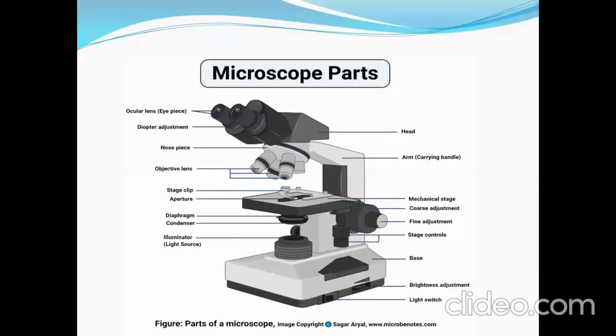If we are choosing a certain field in the slide, you have to focus on that portion where the cells are well separated, well stained, and in the background there is no stain. That is the ideal position of the specimen in the slide. You have to choose that position with this 10x lens, which is called the low power objective. Then you focus the slide with the 40x, and finally with the 100x objective lens. So these are the different lenses with different magnification values.